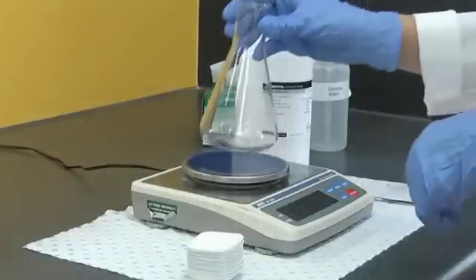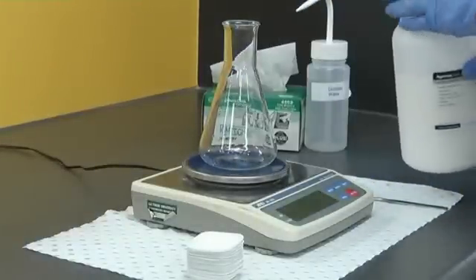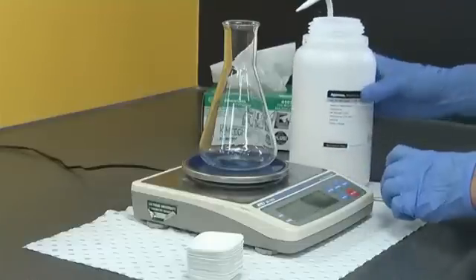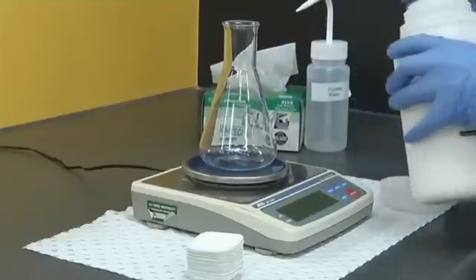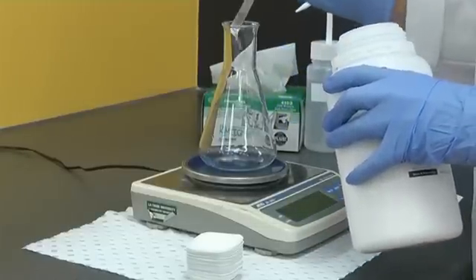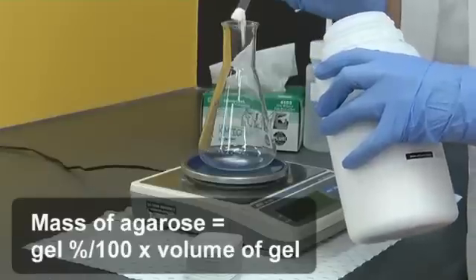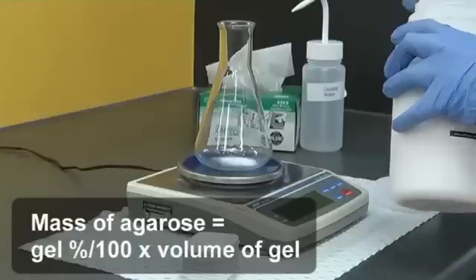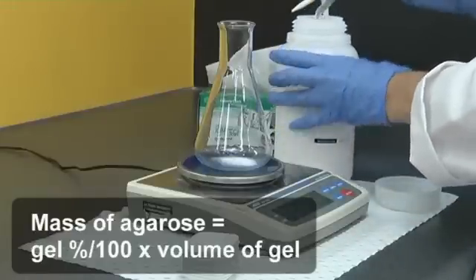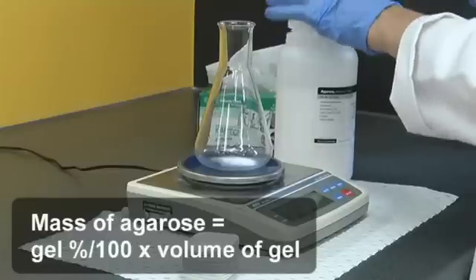You will need to weigh an appropriate amount of agarose into your conical flask. This will depend on the percentage gel you require and the volume of the casting tray. A standard 10cm casting tray will require 60ml of gel. To determine the mass of agarose required, divide the percentage of the gel by 100 and multiply by the volume. For example, for a 0.8% gel of 60ml volume you would require 0.48g of agarose.